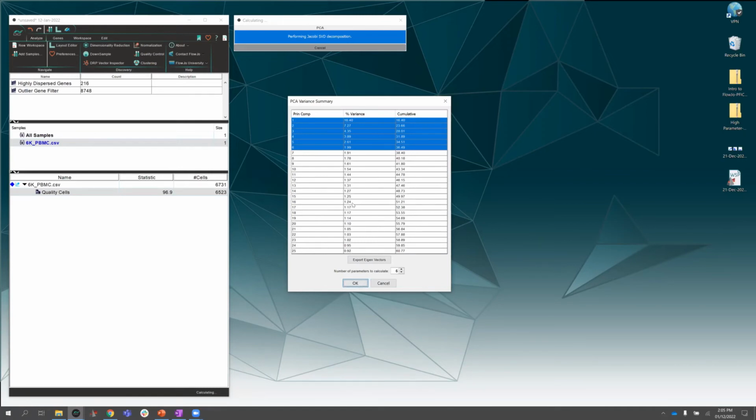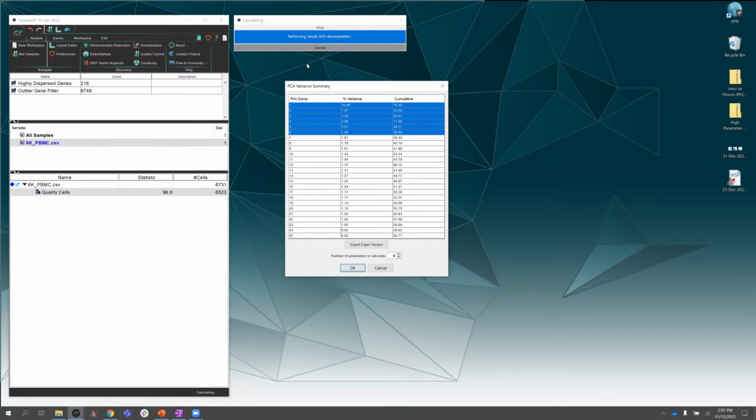the ones that follow one of two rules, right? Some people like to follow the 1% rule: once my variability goes below 1%, maybe I don't want those principal components. And then some are of the school of thought that you typically don't need more than 15. 15 principal components is perfectly fine for your data. You don't need to take any more with you, okay? So it's up to the user. You can try different approaches, see what gives you the best results.